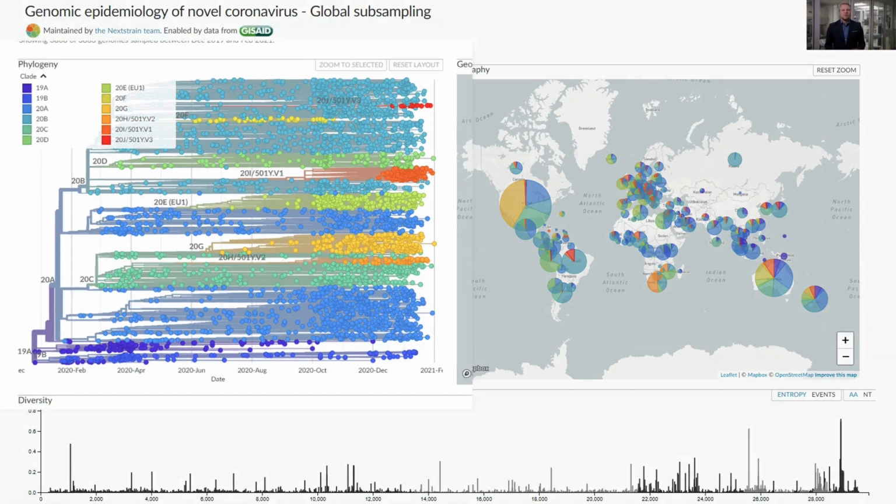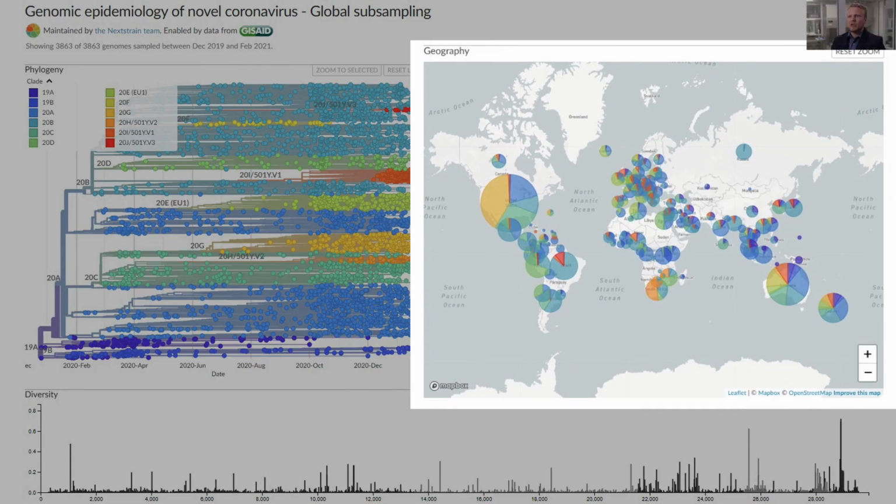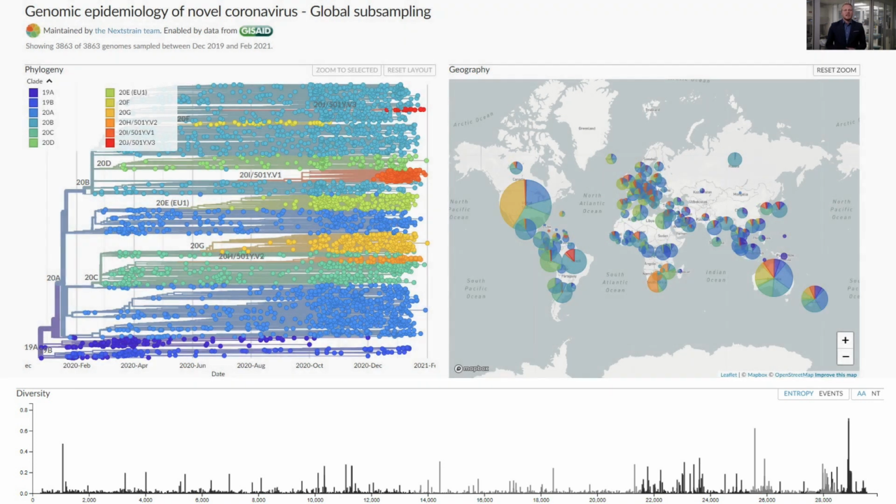For our monthly analyses, using the Nextstrain subsampling, this is an extremely useful tool showing predicted phylogenies here, countries of origin, including nearly every country worldwide here, and at the bottom, they compile location and frequency data for the mutations on each of these strains. Using this, we are able to look at the binding targets of our primers and analyze mutation data relative to our tests. So, for the results of those analyses.